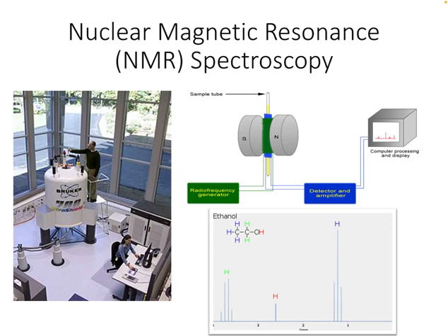Now down below I have a picture of an NMR spectrometer. You can see that the person standing next to the spectrometer is on a step ladder. So these are pretty large instruments. Now they can be smaller or even larger, depending on the strength of the instrument. These instruments are using magnets, so it really depends on the strength of the magnet.